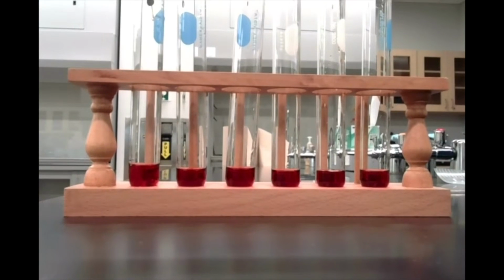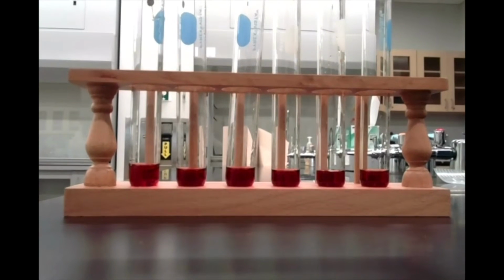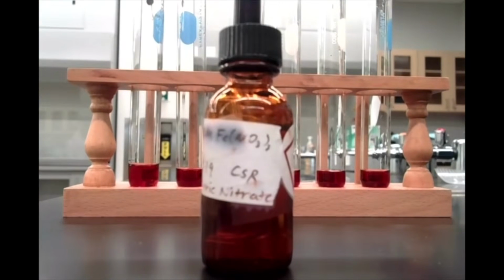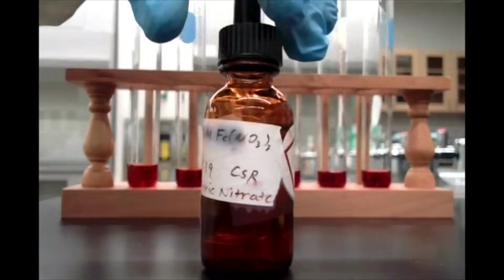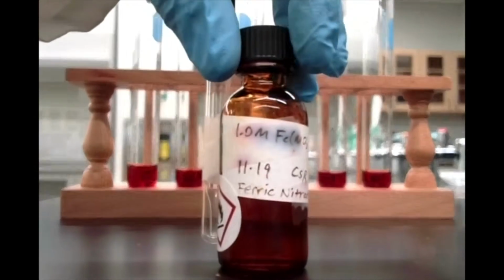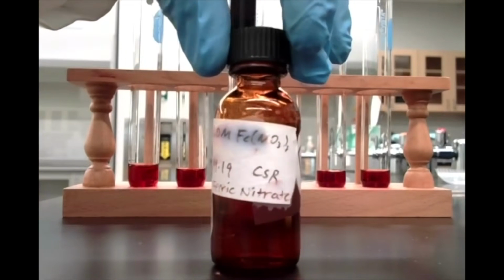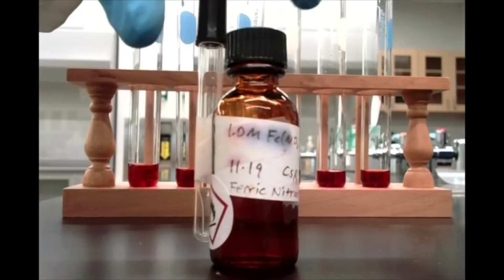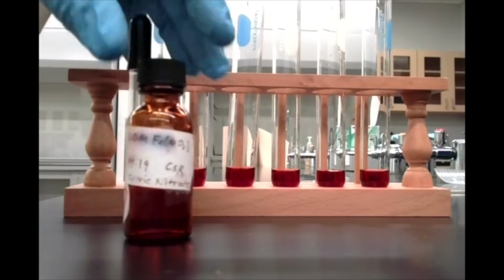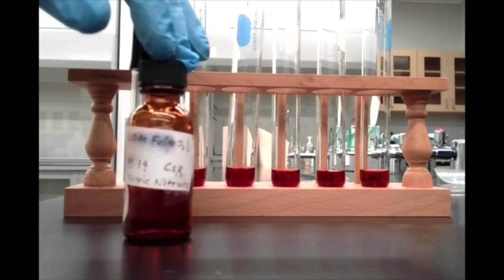All right, so at test tube number 2, I'm going to add 10 drops of 1 molar iron 3 nitrate. The thing to observe here, first of all, is that this is 1 molar iron 3 nitrate, so it's much more concentrated than the solution we started off with. The key thing here is that we're adding iron 3 plus ions.